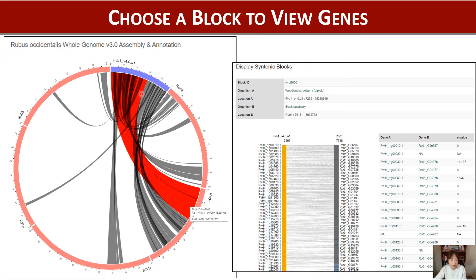Whenever you hover your mouse over a block, the synteny block is highlighted and it shows some information. If you click that highlighted block, a page like this shows up.